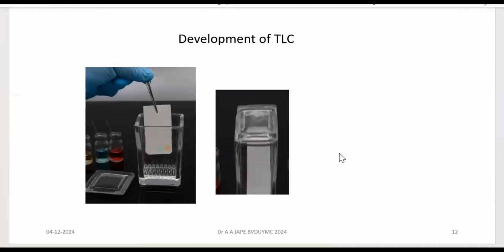Some solvents, for example phenolic solvents, in an ammoniacal environment react with small quantities of copper if it is present in the paper and get oxidized, and they produce black or brown spots on the paper. Similarly in TLC, you have to take care that the solvent system doesn't go into its oxidized form and is not going to have erroneous spots developed at the end of TLC.